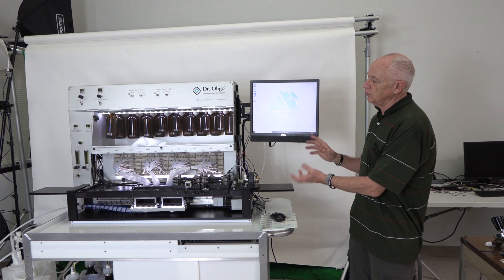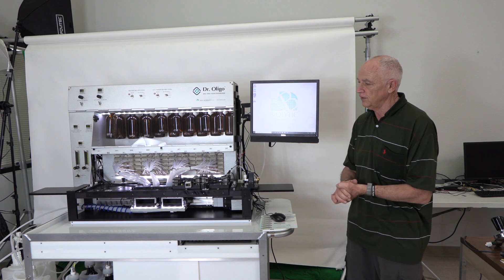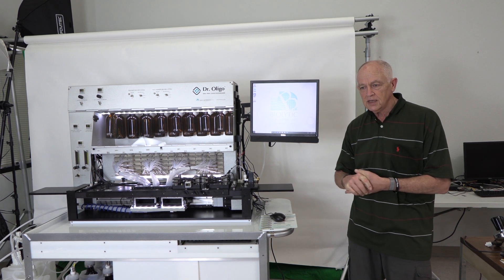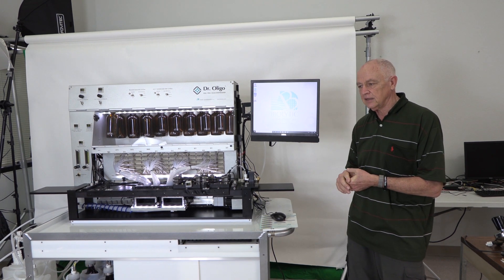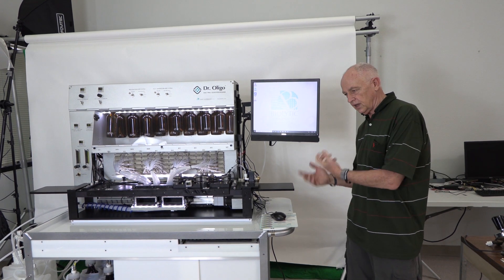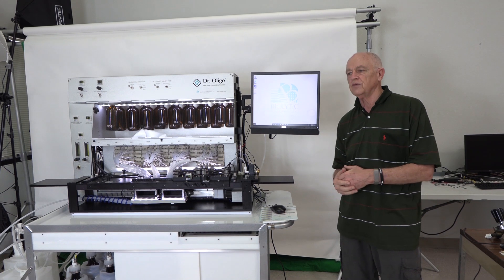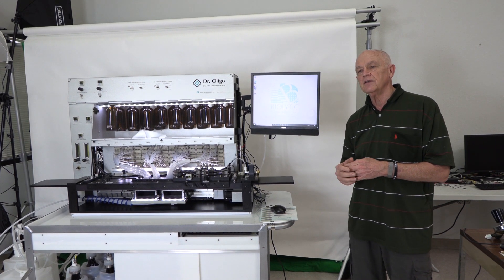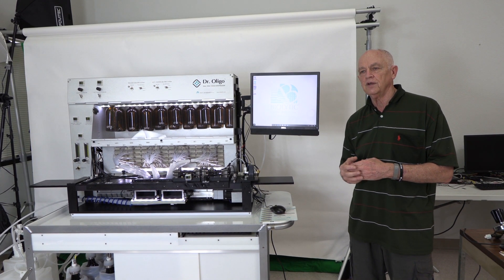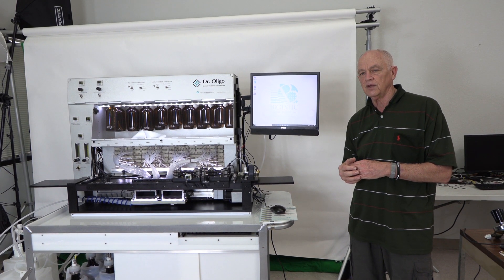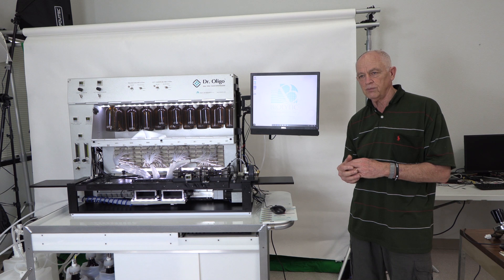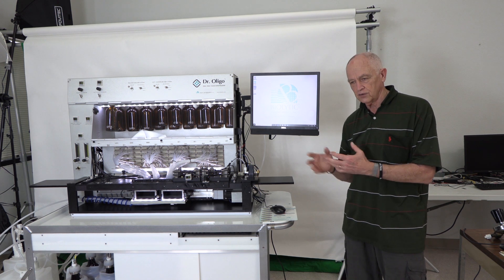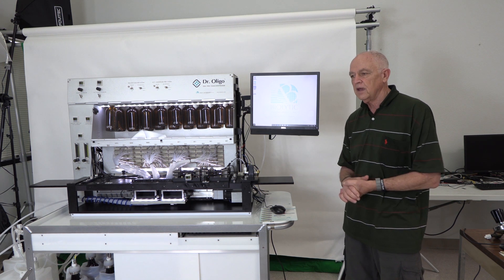This basic unit we call the XLC model and it comes in a 192 which would be a two plate system that would synthesize on 96-well plates. Two times 96, 192.